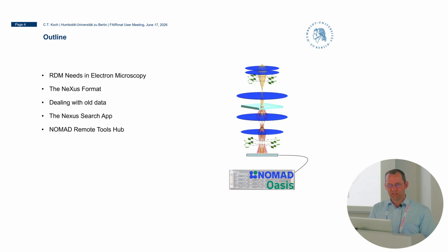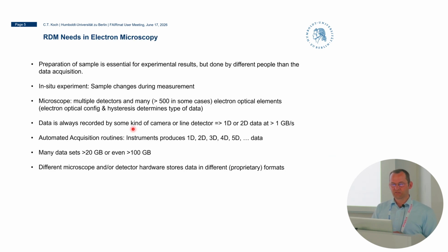And then this Nexus Search app, which is linked to this Nexus format, helps us deal with all the data that we upload. And then we also make use of the NOMAD Remote Tools Hub. For our needs, this is really perfect, and I'll show you more on that. So let me start by getting into research data management needs for electron microscopy.